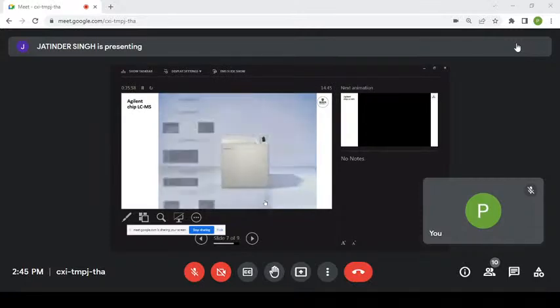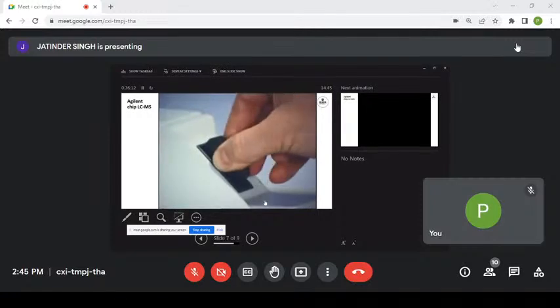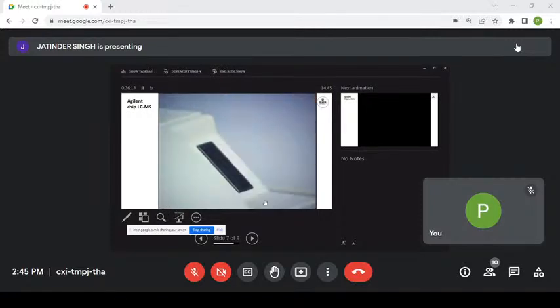I think that was the excitement for the afternoon. Yeah, grey box. But yeah, so it shows what's happening with the analytes. It sees them coming onto the column. It shows you how the solid phase extraction works. I like the fact that they revert the flow so that all the analytes are stuck at the front of that column. And then they get out at the back. And you can see them getting separated.